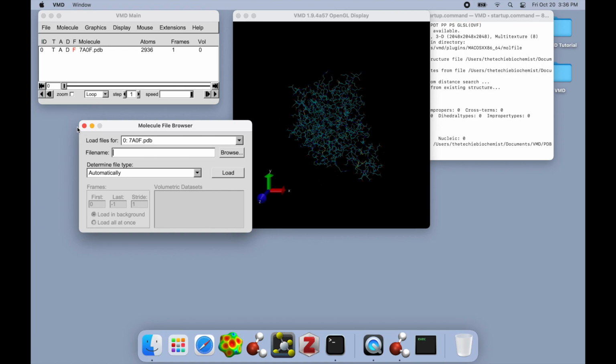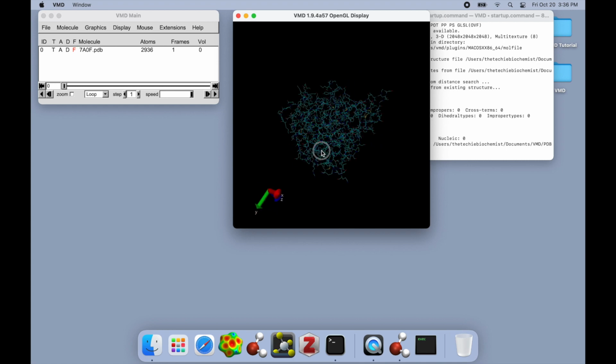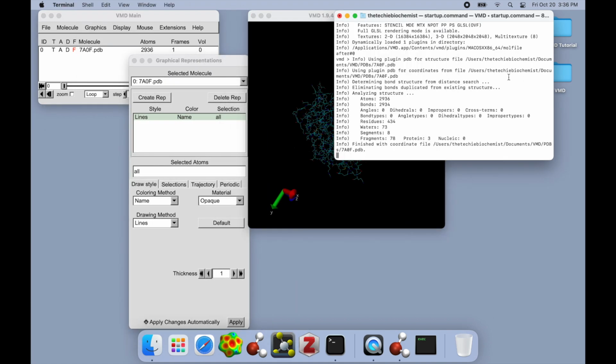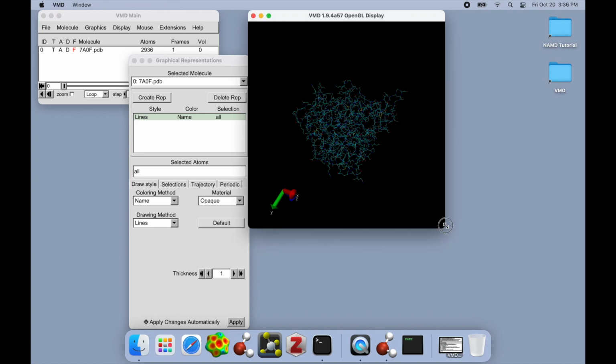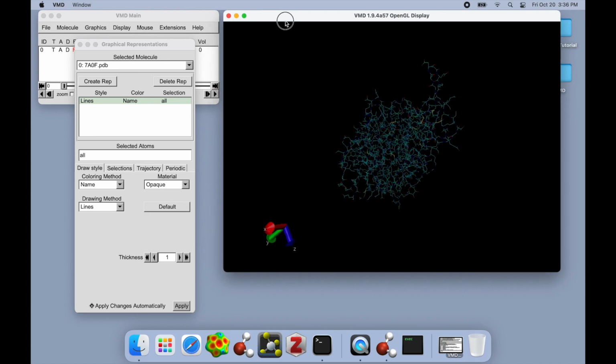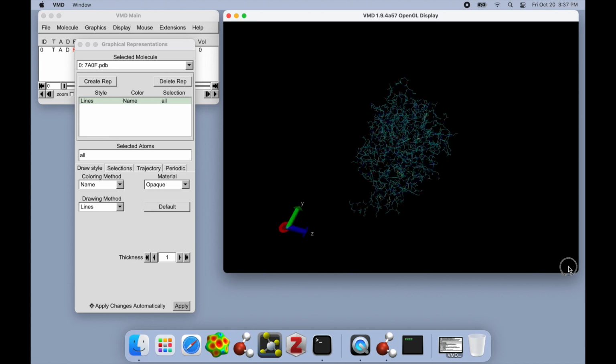And this PDB is a combination of 2 bovine thrombin subunits and a hirudin, which is an anticoagulant protein, all in complex together. So this molecule is going to be really cool to illustrate a couple different things I want to show you guys today. So I'm just going to minimize that so it stays out of our way and isn't a distraction, and make this a little bit bigger so we can see it nicely.